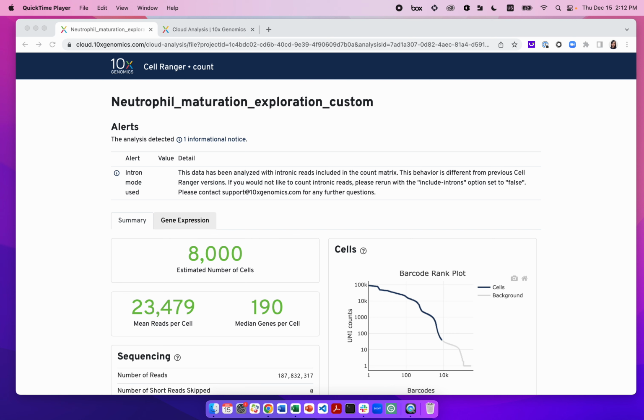My name is Juan. In this video, we'll learn how to assess overall quality of our single-cell gene expression assay using web summary file output from CellRanger.